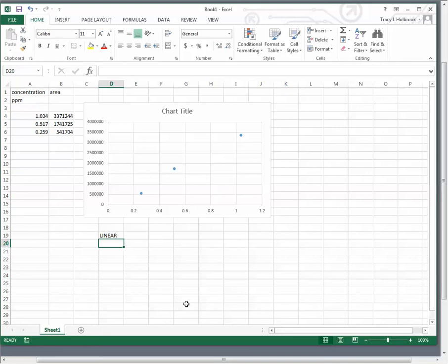One should not be higher than the other and out of sync or out of order. That means I've done something wrong. It needs to be linear. How linear is linear? Well, the scatter plot will show you. You just need to go in and make that setting change.